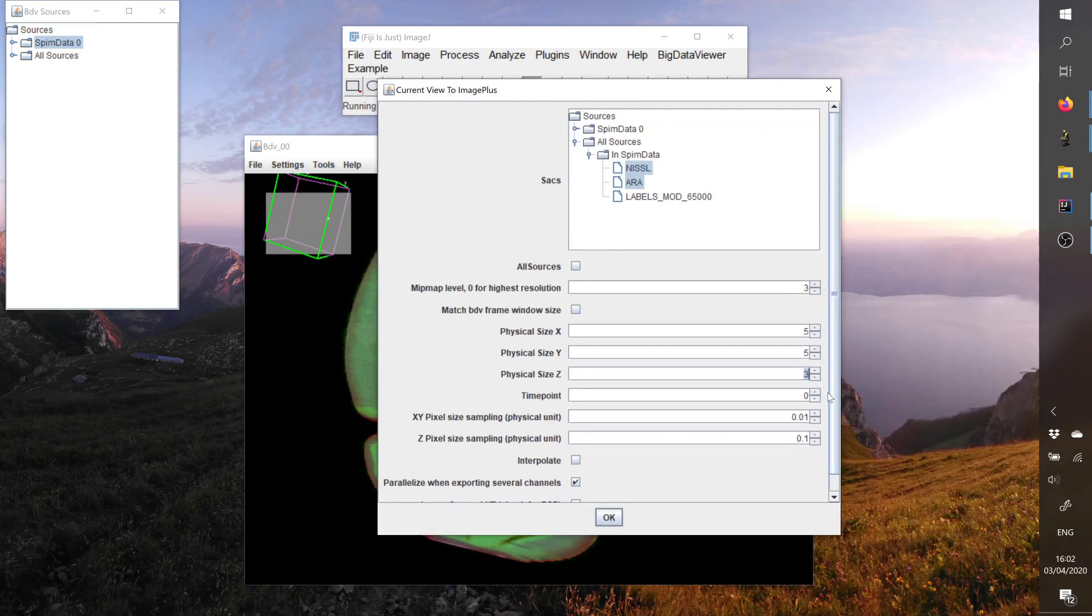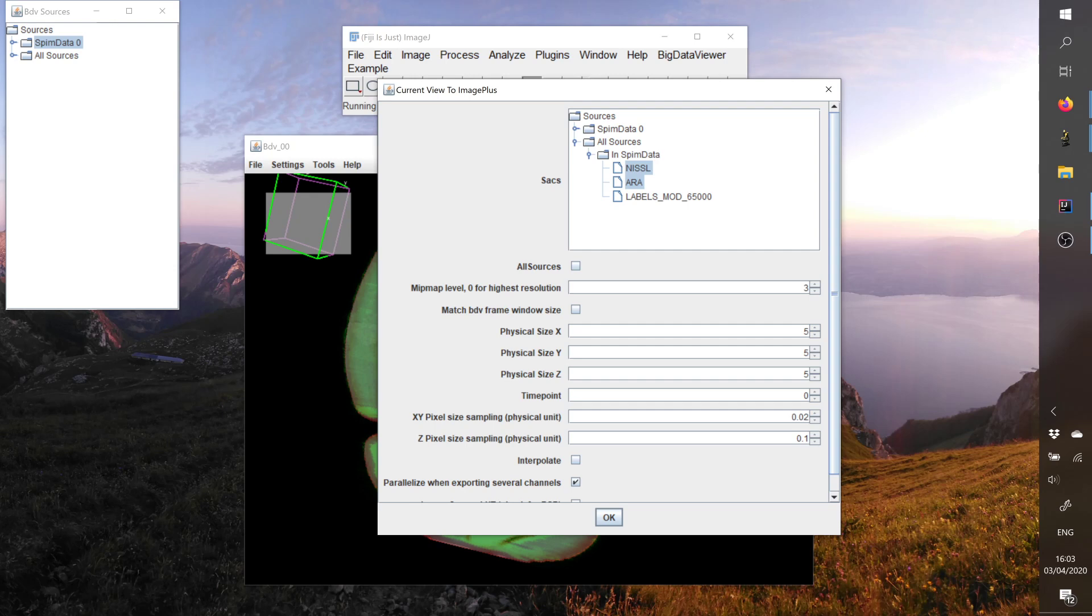And here one of the main differences is that you can export this stack. So maybe I really want a block of five-five-five. And time point is zero because we have only one single time point. And now I will do a voxel size of zero, let's say 20 microns in XY, but only 100 microns in Z.